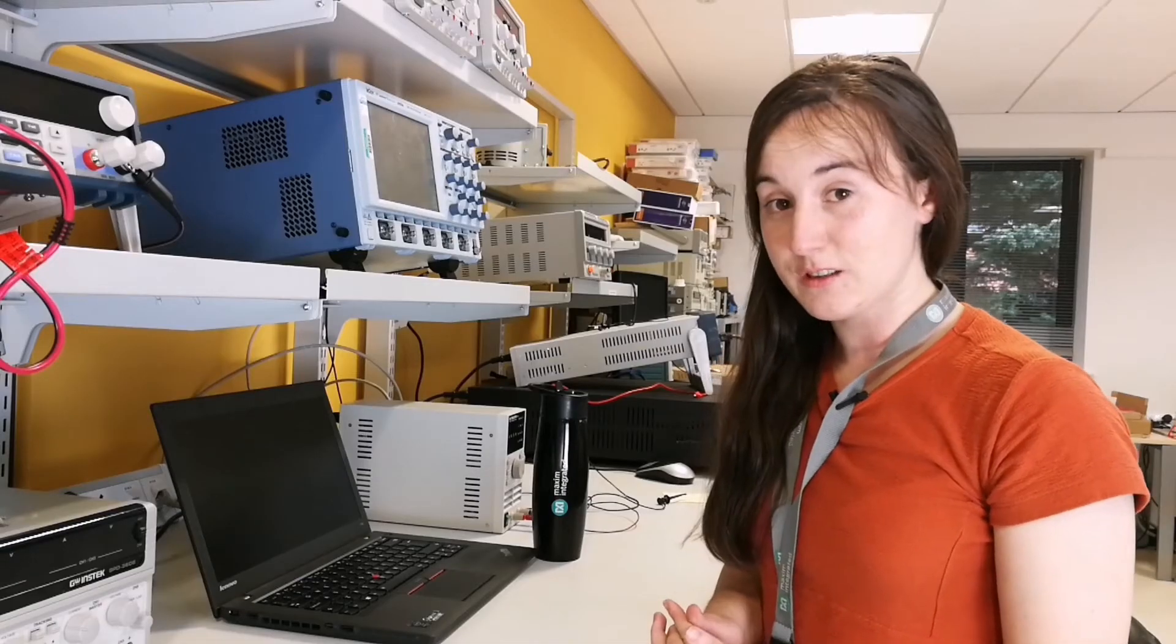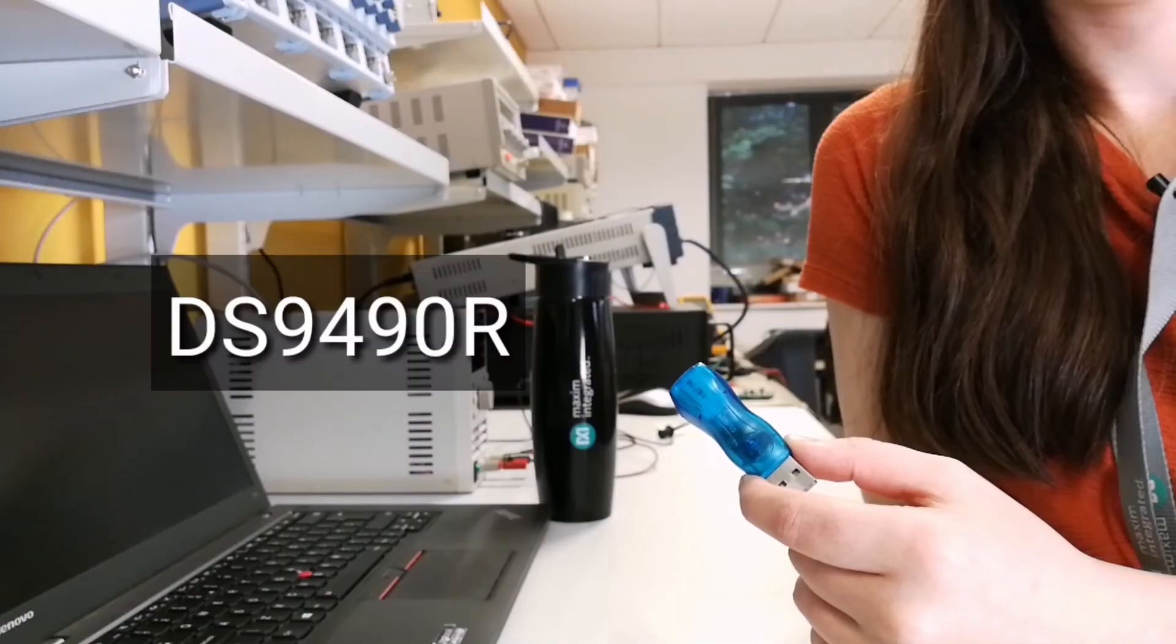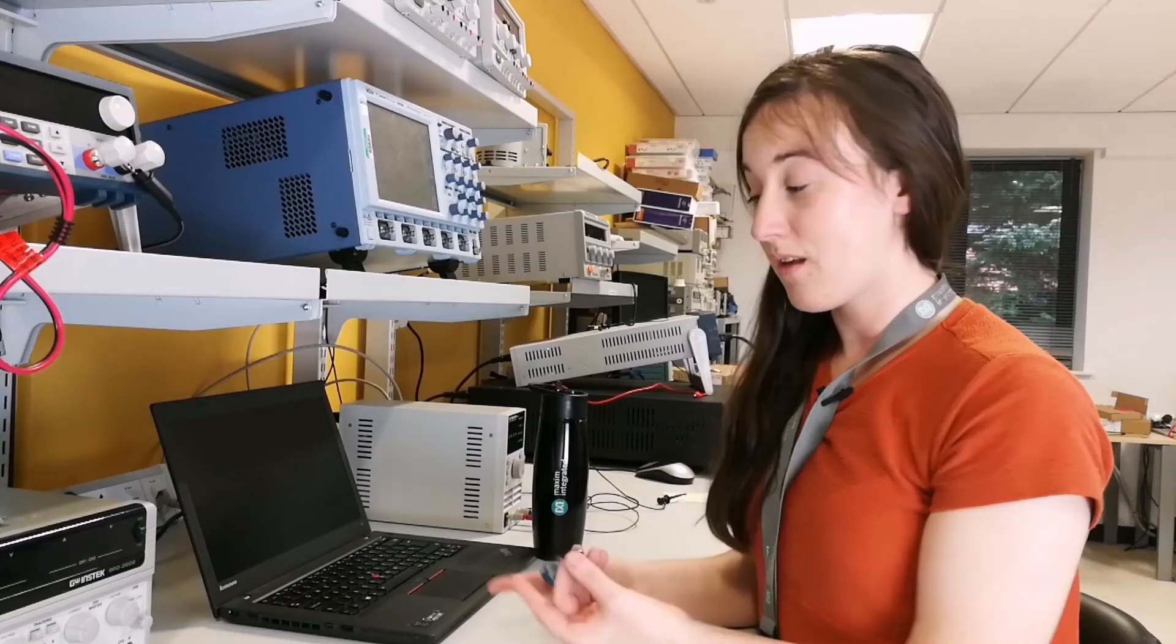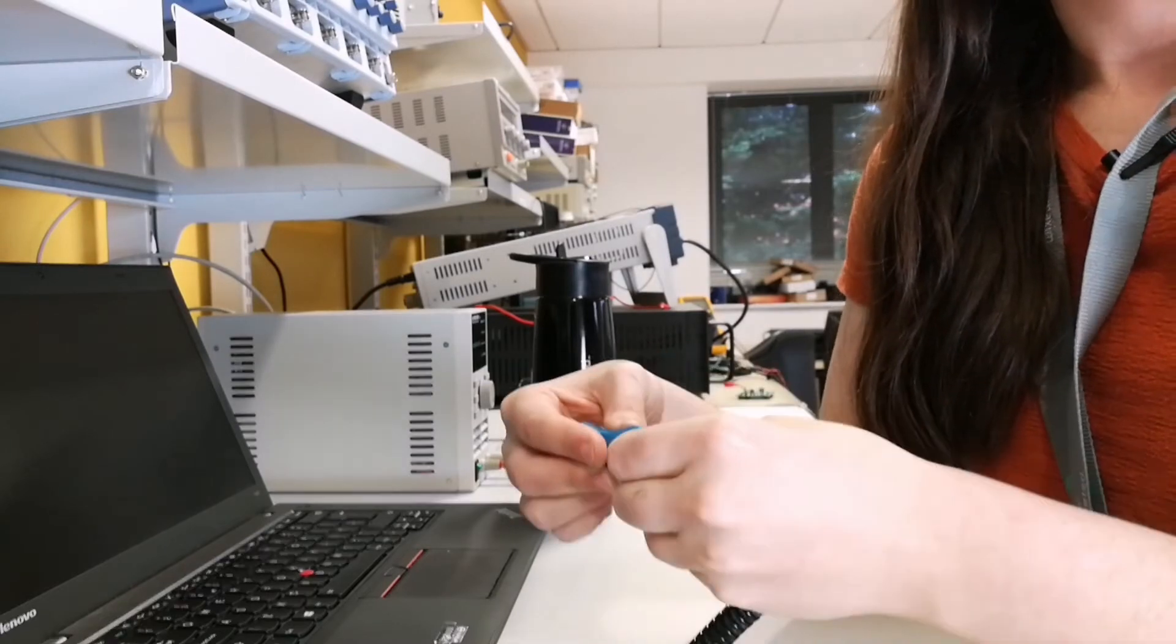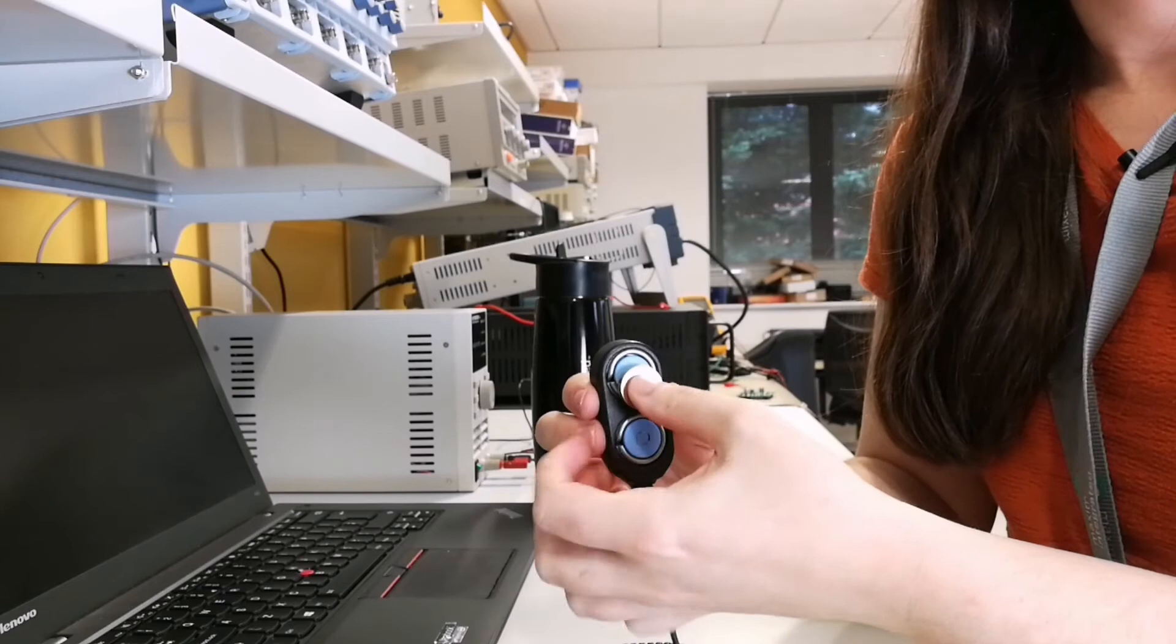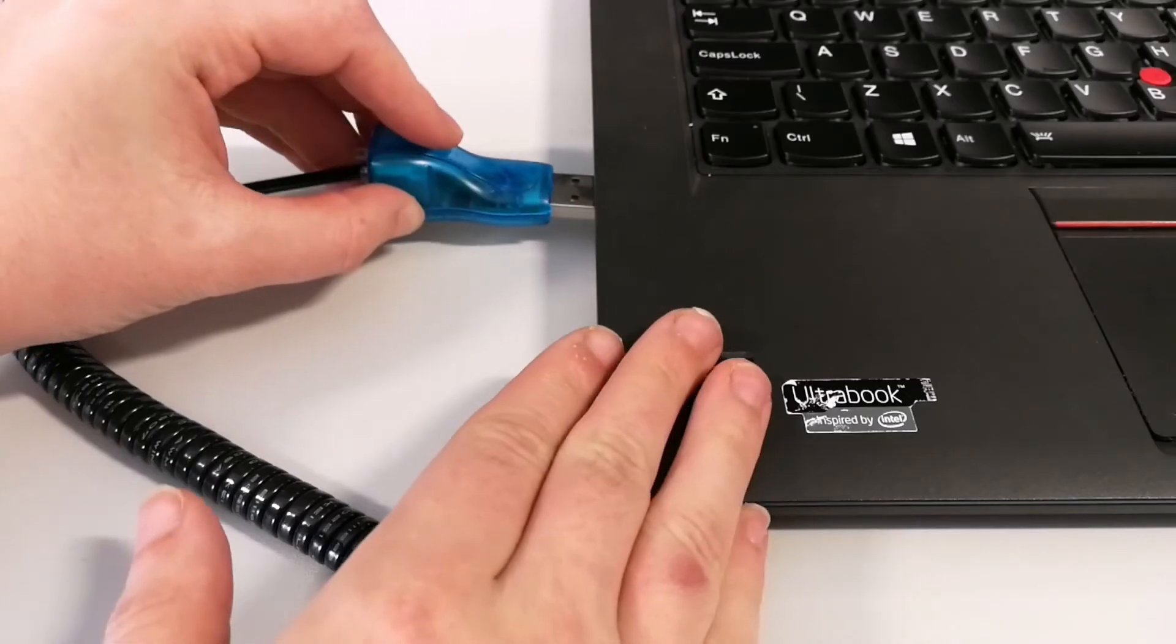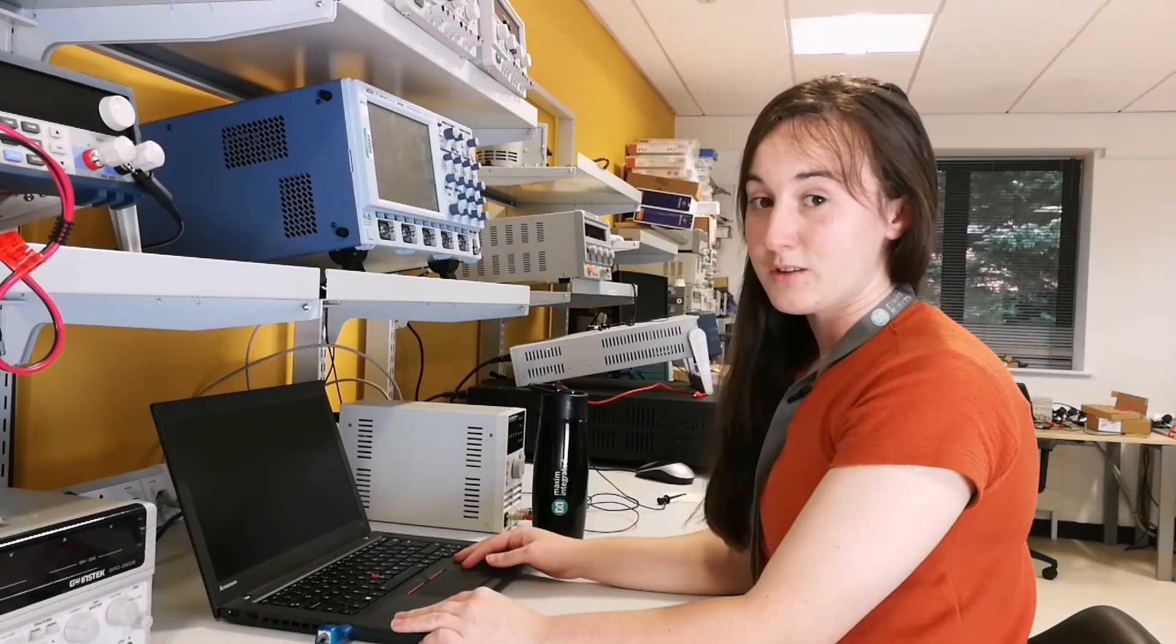As noted in the previous video, to set up an iButton with the OneWire Viewer, you need an adapter, reader, an iButton and your laptop. We connect all these together, plug into our laptop and open up the OneWire Viewer software.